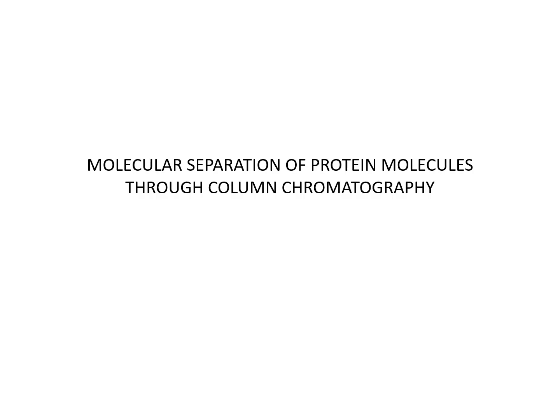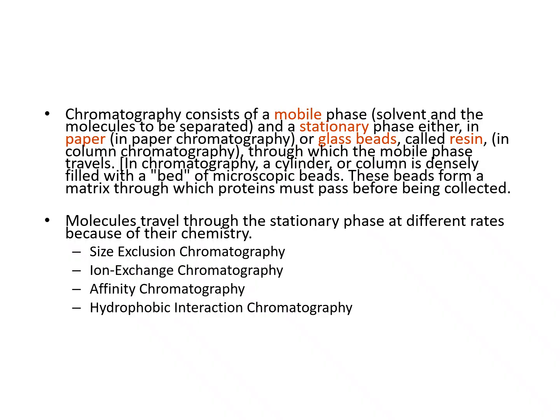And then the next section, we will discuss the molecular separation of the protein molecules through column chromatography. This section basically will discuss how you target a specific protein, how to isolate the specific target protein. After the cells are broken and the cell extract is released, you go through the sorting out and the acetone precipitation, and then recover the protein and resuspend it. The next step to purify protein is to go through column chromatography.